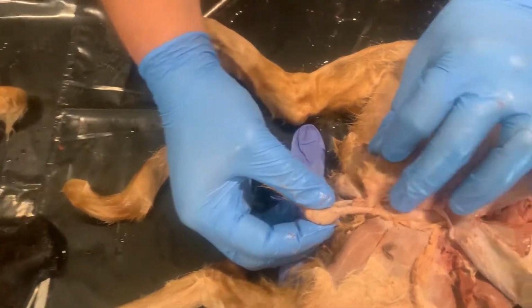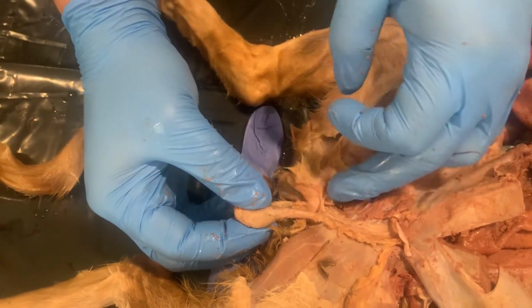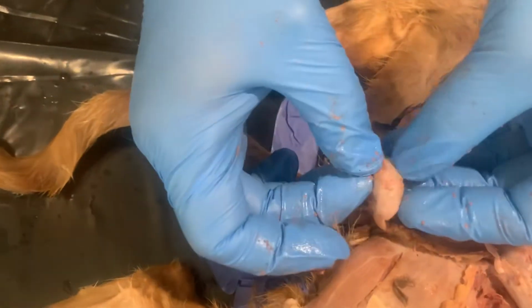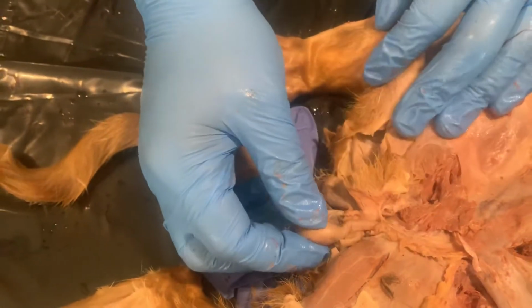There's our penis. Vas deferens comes up into the body and then comes out the penis around the inguinal ligament right here. So you have your vas deferens. If you squint, you might be able to make out the epididymis on top of it. It's a little wormy looking guy sitting on top of the testes, all right?